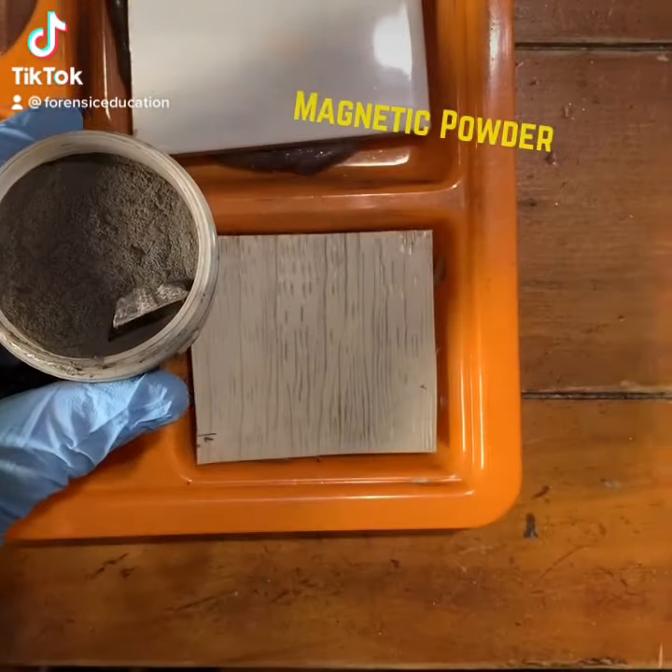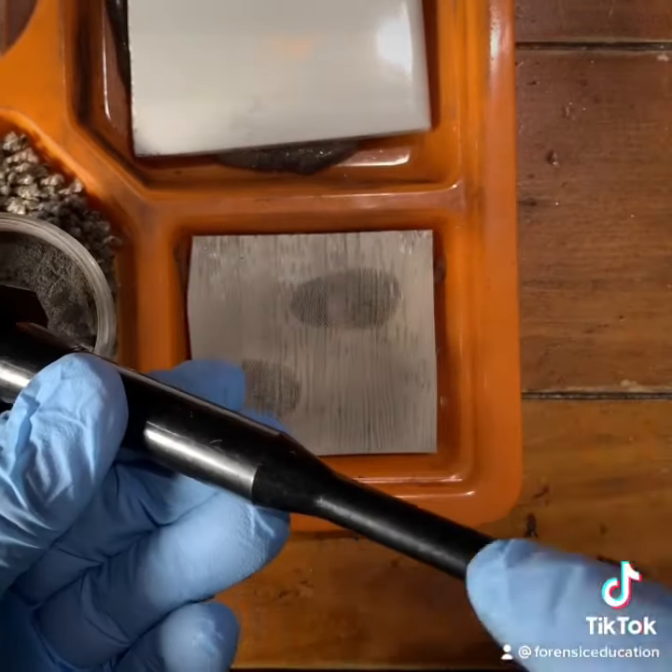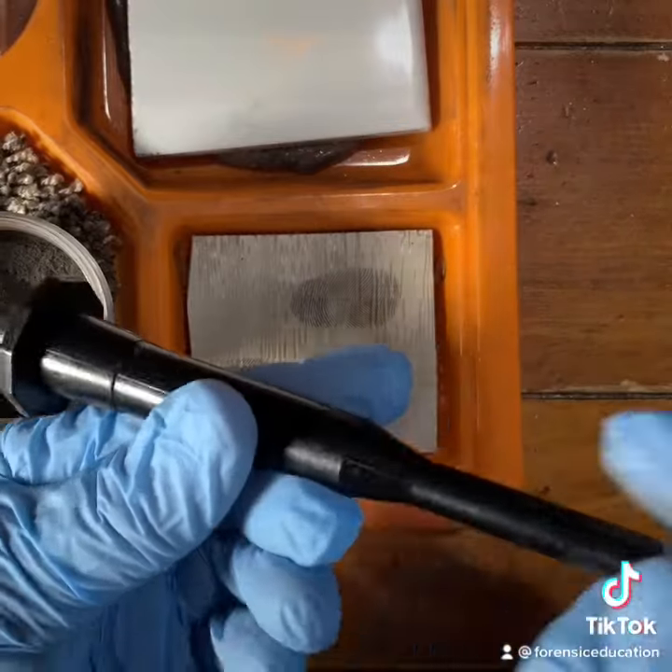I'm going to lift fingerprints on a textured surface. First, we're going to use our magnetic powder. It has a little plunger on the end to drop the powder back into its receptacle.